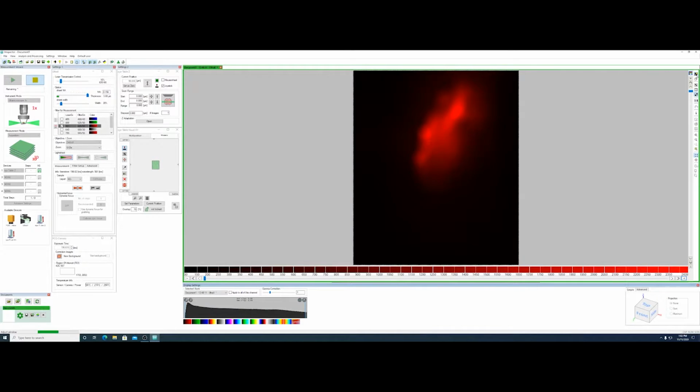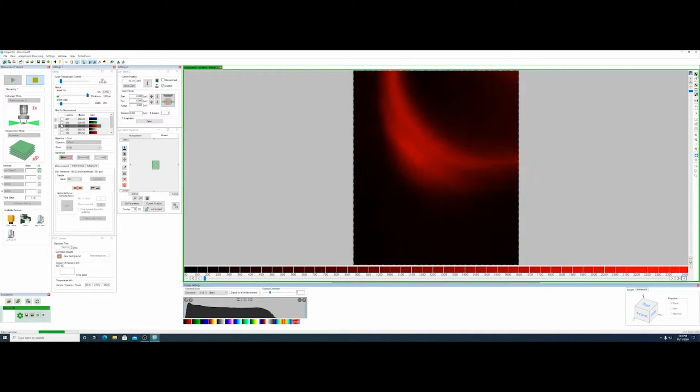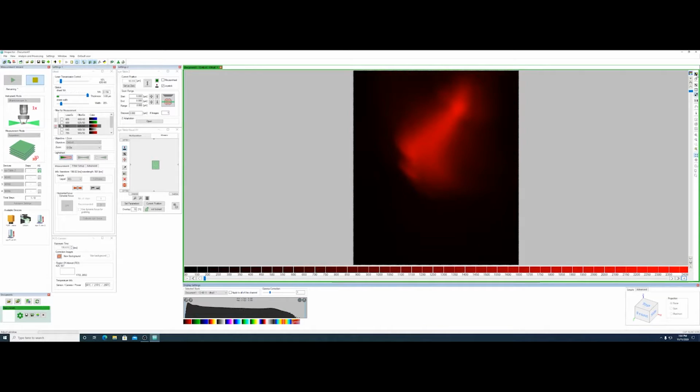This might be a sample. I'm not sure though. No, it's not. Okay. All right, so we found that.